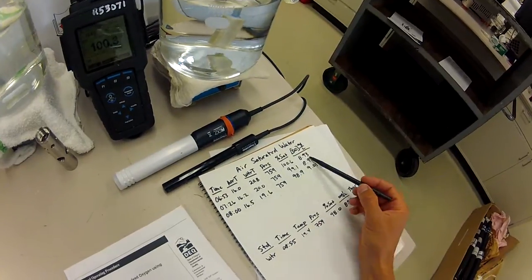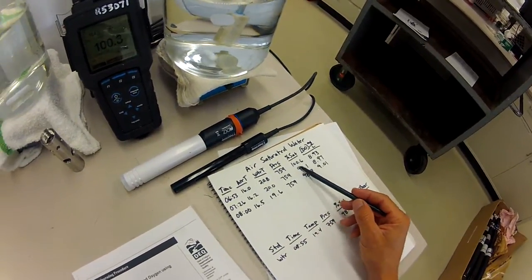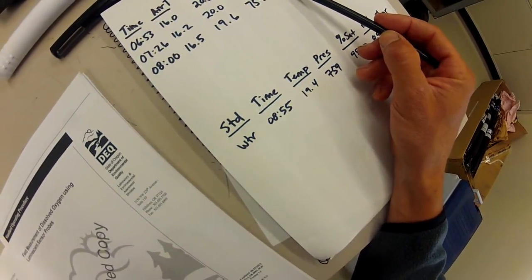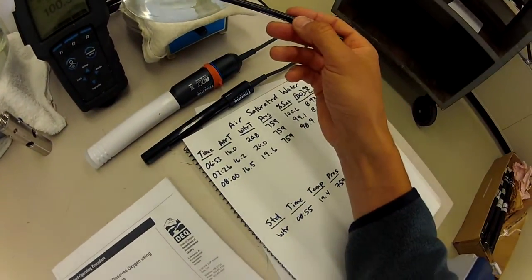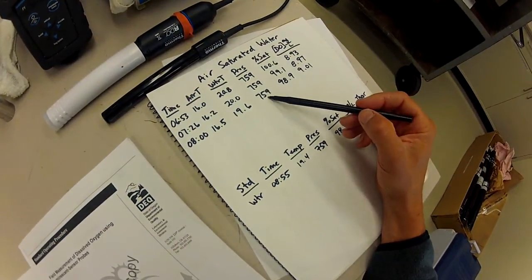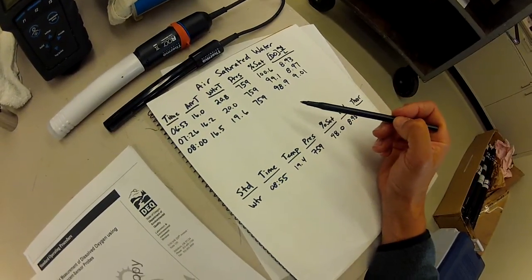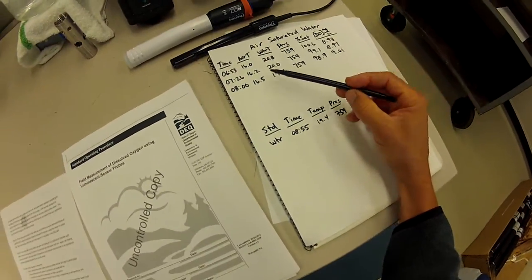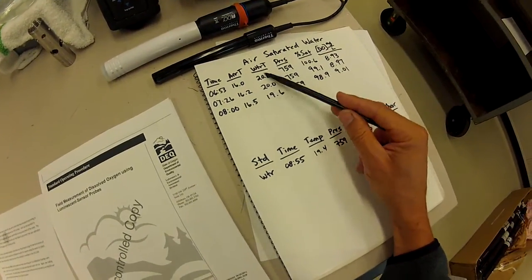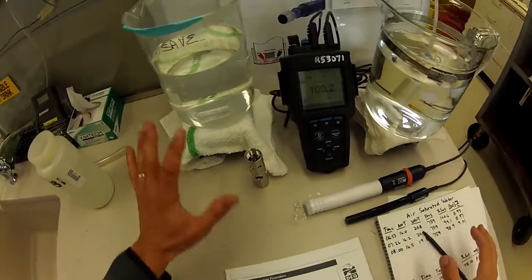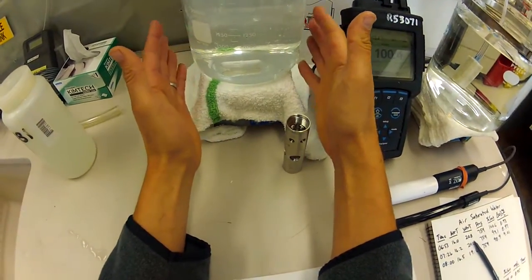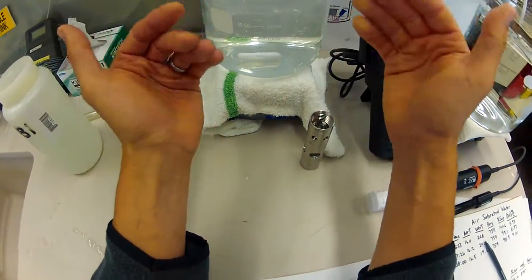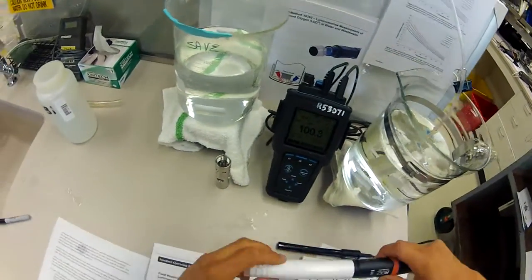I waited 30 minutes with the aeration. I took another reading, still very close to 100% on our saturation. Waited another 30 minutes with it doing just this, and got another reading. Again, pretty close to saturation. You can see the water's cooling down a little bit and air is warming up and the water's cooling down. So this has gone through the whole process, 30 minutes with air, 30 minutes without. Now it's ready to do my calibration verification.